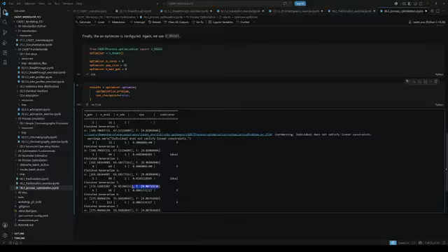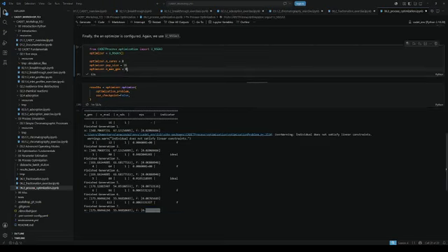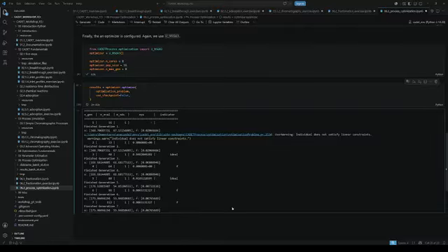All right, so in the fifth and the sixth generation, there were no better results found. It will probably stop after the eighth generation because no better process was found. And then at the end, we will probably see that these are the best available points right here. So we should run this process with 166 seconds of total cycle time and 61 seconds of load time.